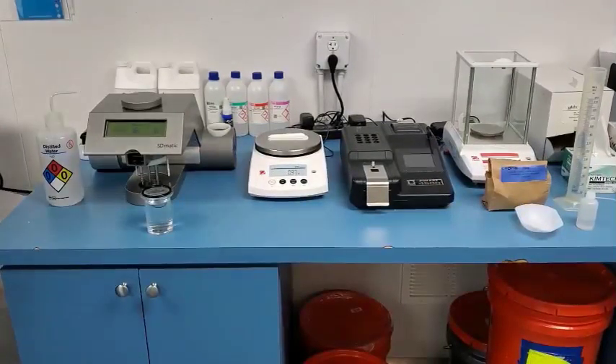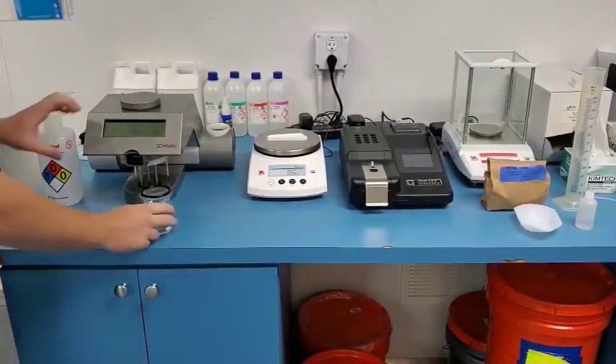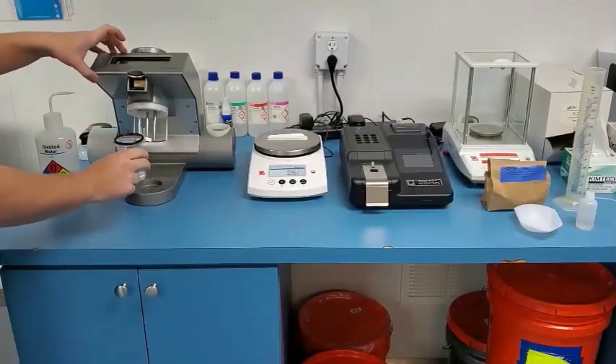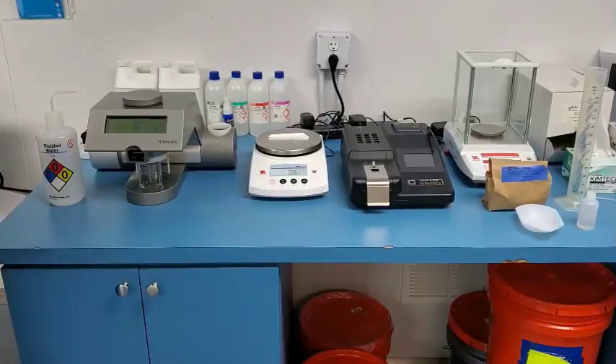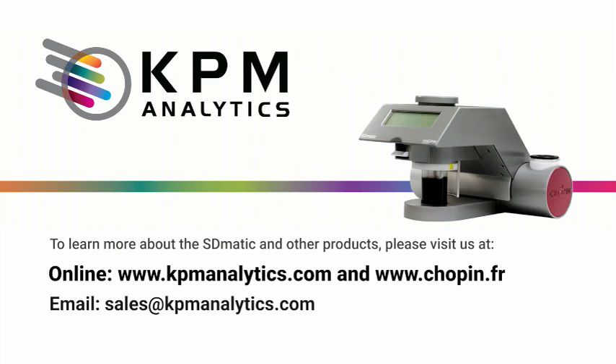After you are finished with the cleaning procedure, all that's left to do is replace the reaction bowl filled with distilled water only underneath and close the unit. That is the resting place for the bowl and that is the way that the unit should be placed after all tests are completed. We hope this presentation was useful. For more information on our products, please visit us at www.kdmanalytics.com. Thank you and have a great day.